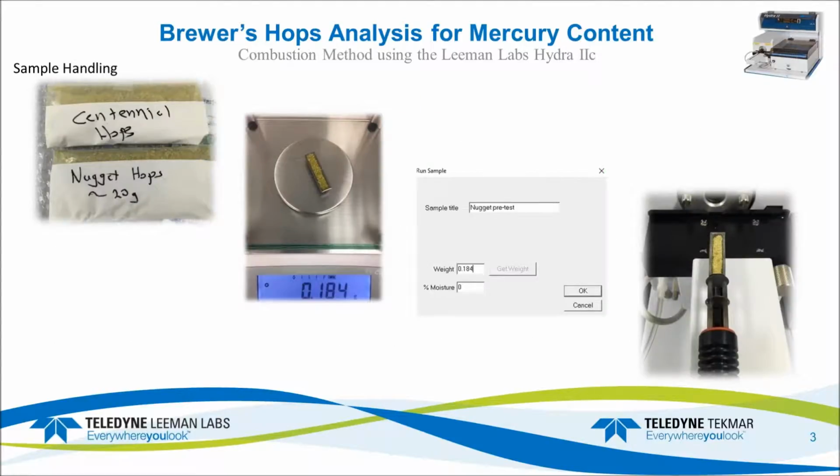The sample handling was quite easy. I didn't have to do any prep. It came pre-ground and looked pretty uniform and homogeneous. So I simply did a little bit of testing early on to see how homogeneous the samples were. I did 3 or 4 subsamples of each variety, looking for anything that I needed to tweak or change in my range. I used a range that was very significantly low, since it turned out these were going to be fairly low.